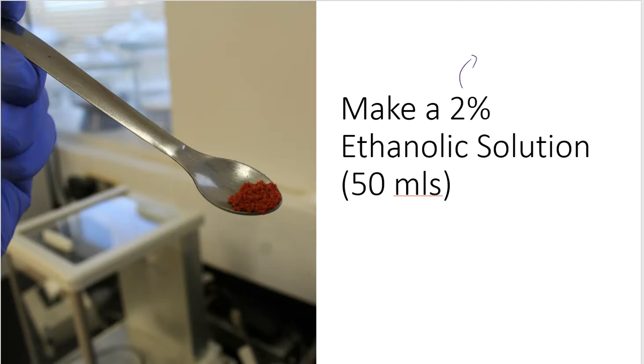You're going to have to change that 2% to a decimal, which is 0.02. All right. And you're going to take 2% and multiply it by 50 in order to get the amount of grams that you're supposed to weigh out. That's how we make a percentage solution. It's 2% of the volume that you're trying to make. So 2% of 50, that value is the amount of grams that we need to use in our experiment.